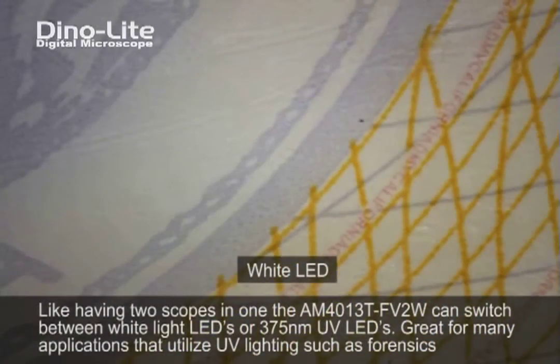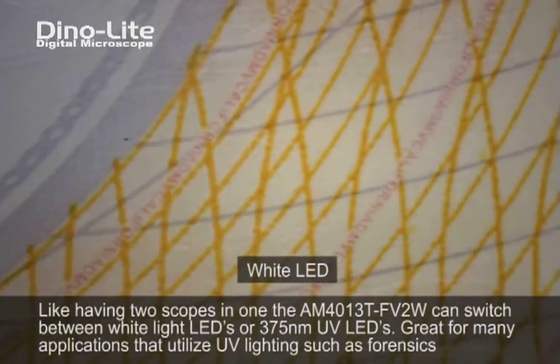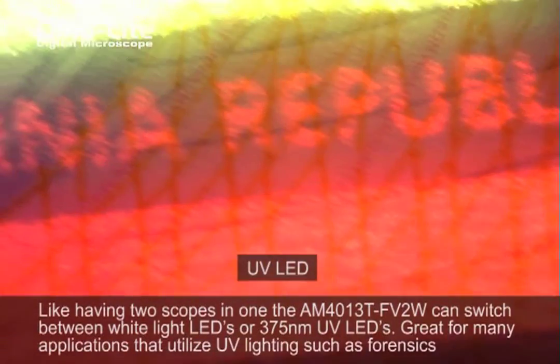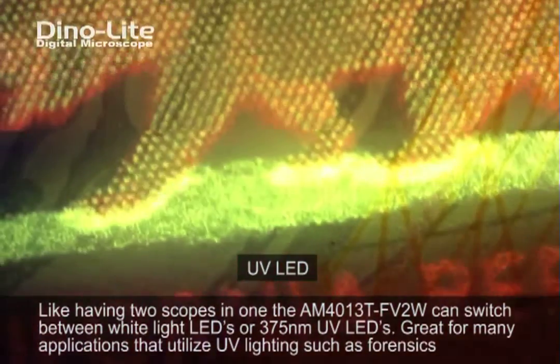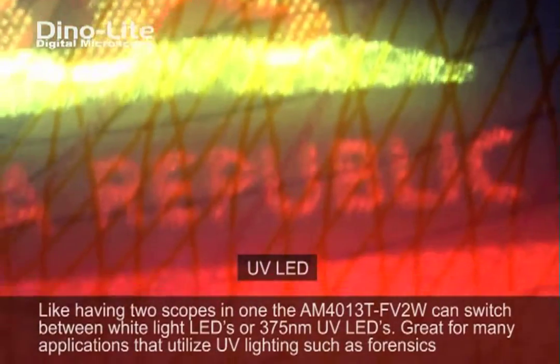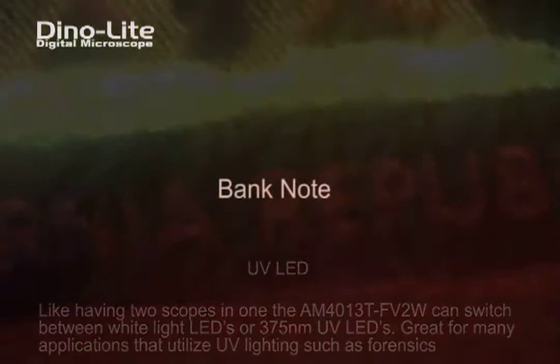This model features frame rate speeds of up to 30 frames per second, a 1.3 megapixel camera, as well as magnification powers going from 10 to 220 times. The FV2W also has a recalibratable measurement feature.